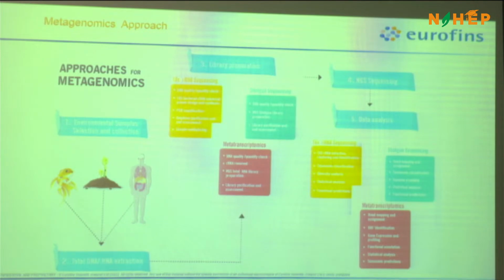There are specific viral databases, RVDB is one of them. You have RefSeq virus databases. We have also developed a custom viral database, and we pick up these viral databases and hit against them and take out the taxonomic abundance of viruses. In those cases, we have to go with shotgun because we don't have set markers in the case of viruses. But for bacteria, archaea, and fungi, we have set gene markers from where we can take out the abundance.